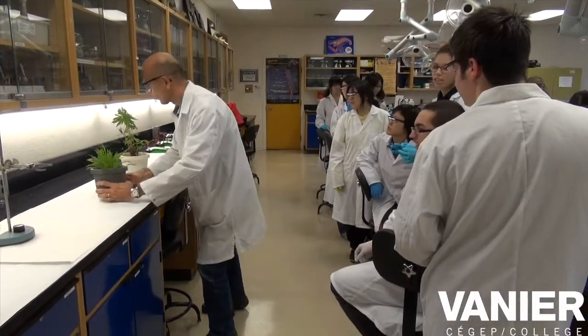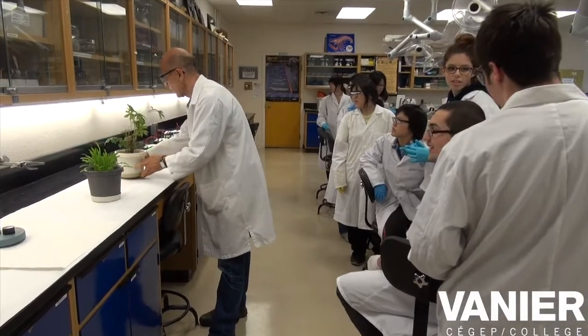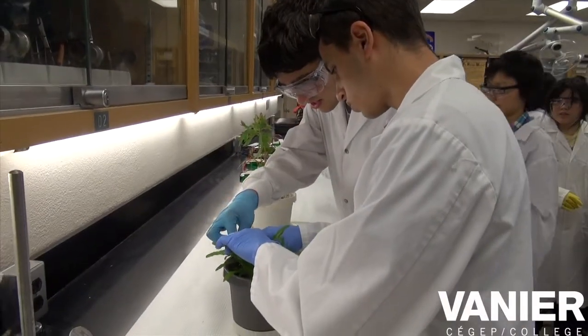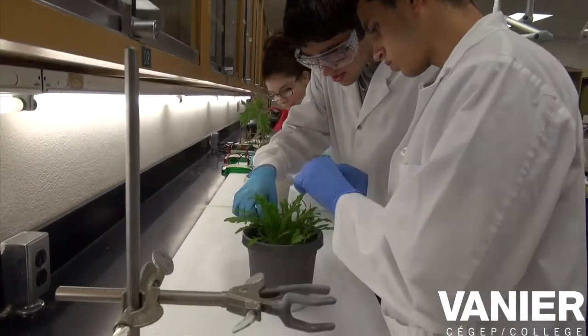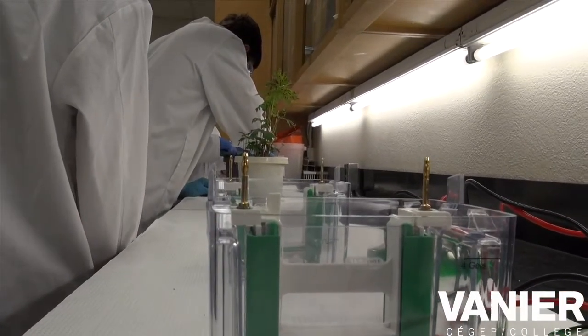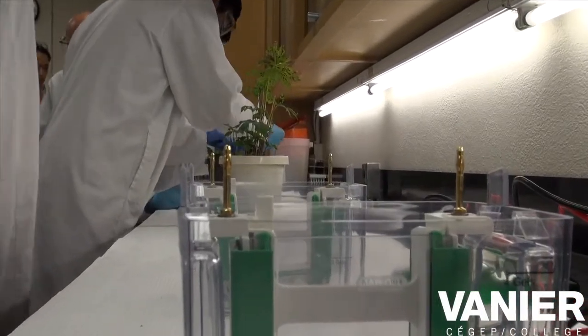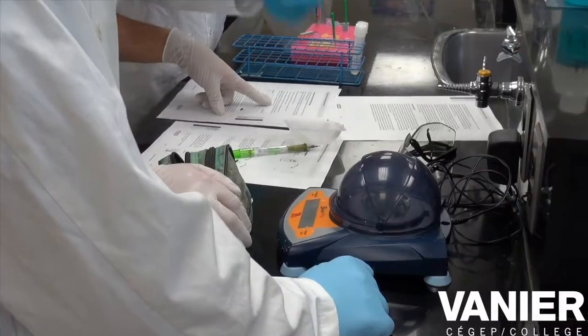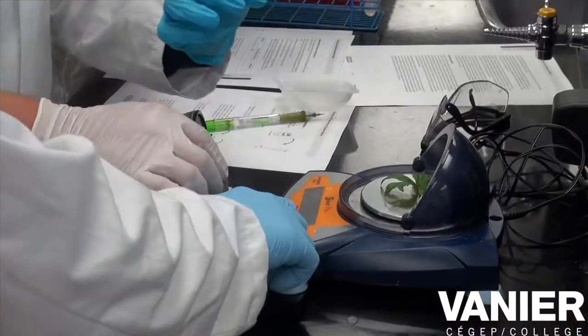All right, I have more of these, I'll bring some more. Dandelion — I mean anemone. How much weight do you need? Milligrams. Oh, that's in grams.